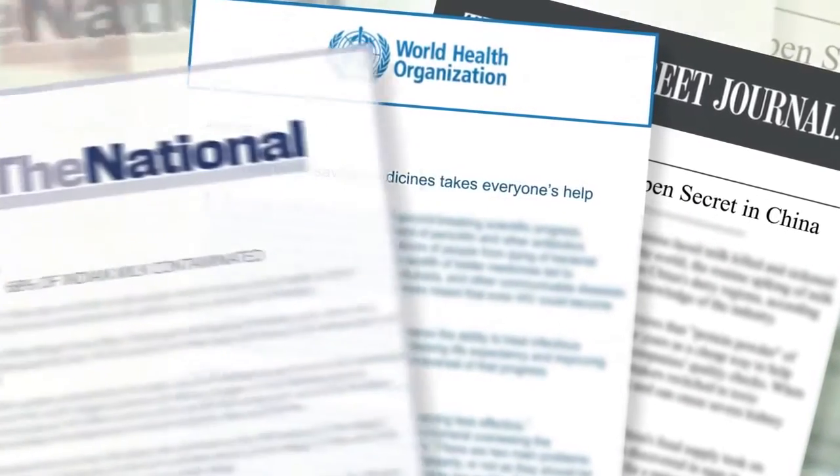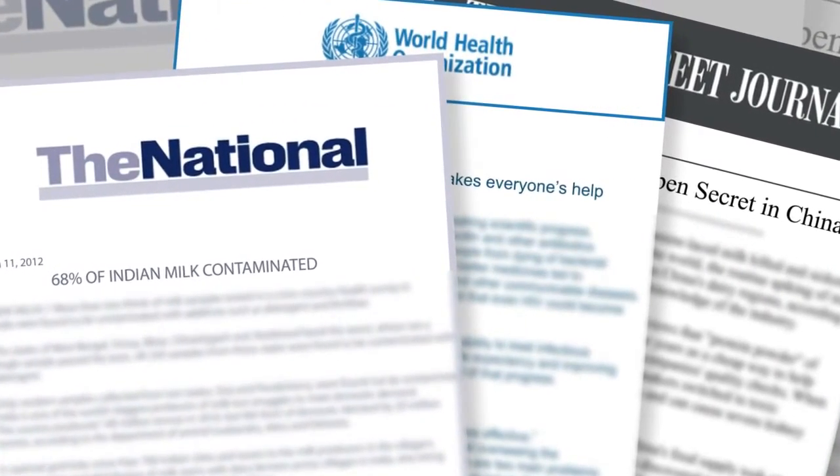Economically motivated adulteration of food ingredients like milk and milk powder is now a well-known issue. There have been many reported cases of dishonest producers adding nitrogen-rich chemicals like melamine in order to boost the apparent protein level of the product and thus the price they can demand. Now, this is a complex problem that needs to be tackled with a range of techniques, including rapid screening tests as well as definitive ones, which can be expensive and time-consuming and often not practical for high-throughput testing.